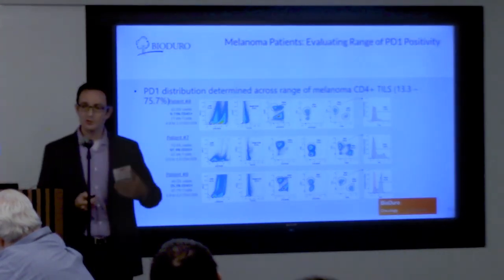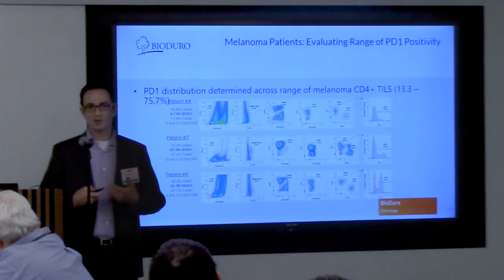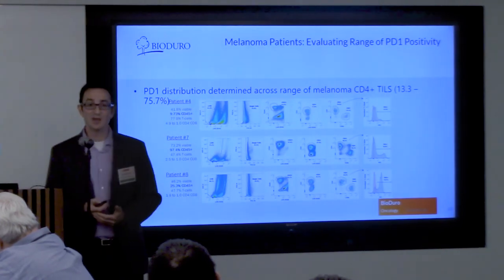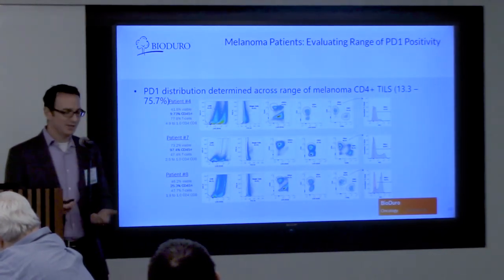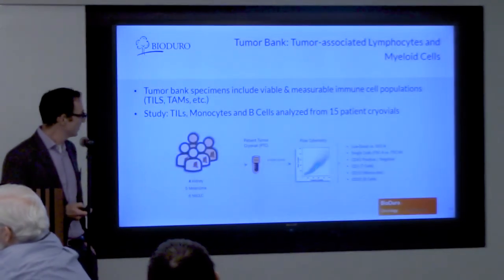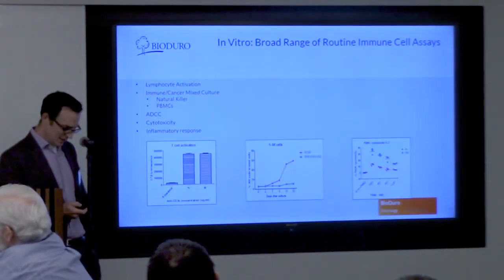Went to the bank, pulled the tumors out, thawed them, stained them, flow cytometry. Essentially a week later, you've got your data set done. So something that might have taken months and months, now it takes weeks. Fine. I'm going to skip through this.